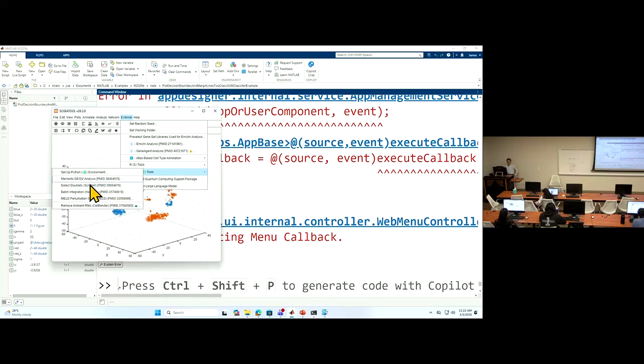I can found a way to fix some of these problems. So as I said, if you know how to re-implement some of these functions, for example in MATLAB, which we are trying to do later on, then you can get rid of these troubles in communicating between packages.